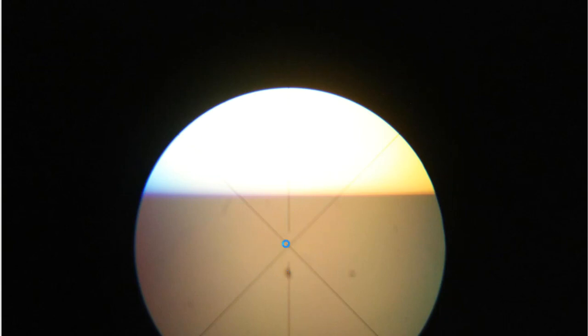So it's going to be my job to raise or lower that dividing line. And I can see that dividing line. It's right there, and it's pretty clear. It's pretty sharp to me. It's not too fuzzy, right? So I need to take that big fat knob over to the right-hand side, and I need to either raise it or lower it. And in this particular case, I need to lower that dark line to the crosshairs. And that crosshair is right there, folks. So this needs to go down.